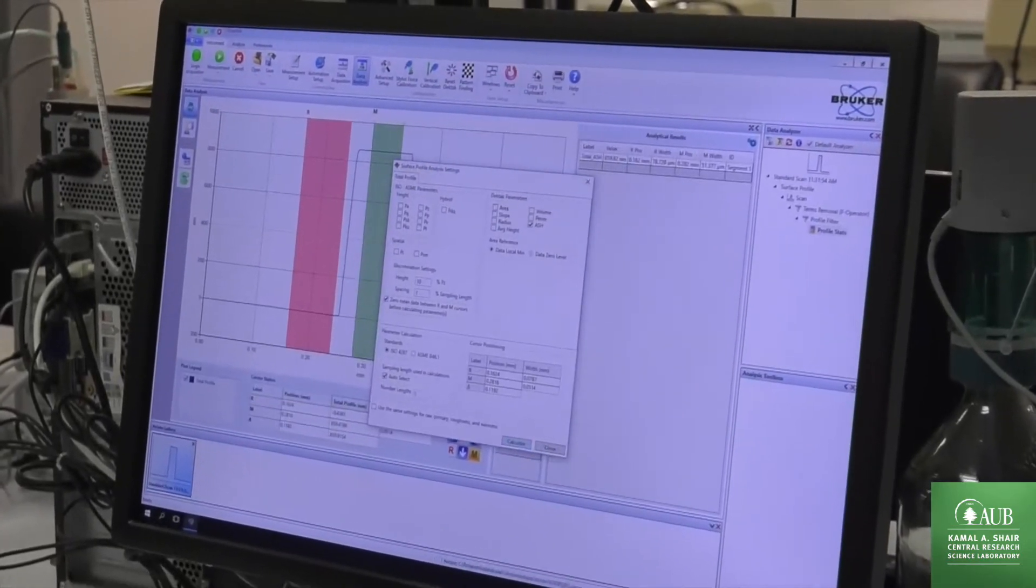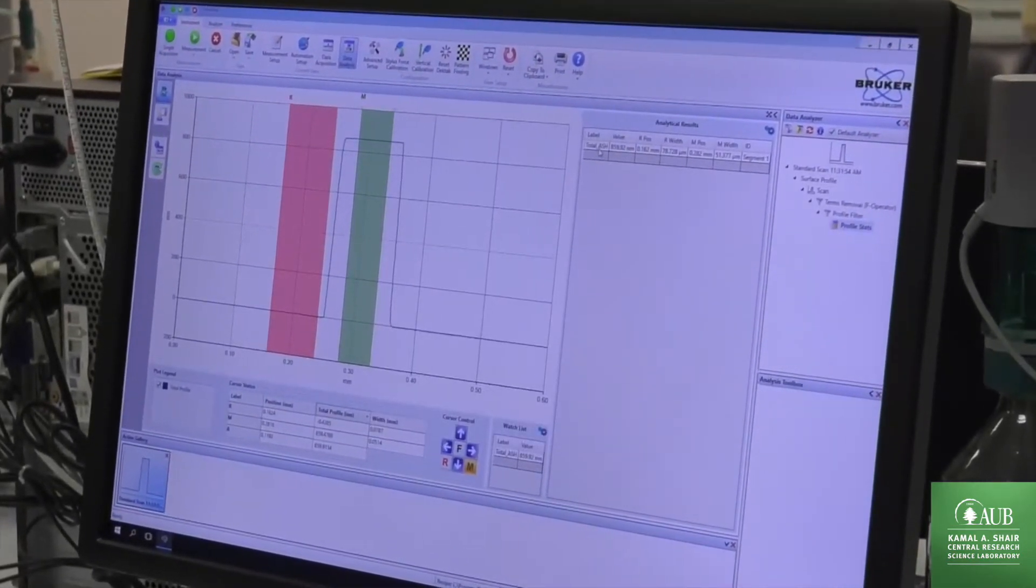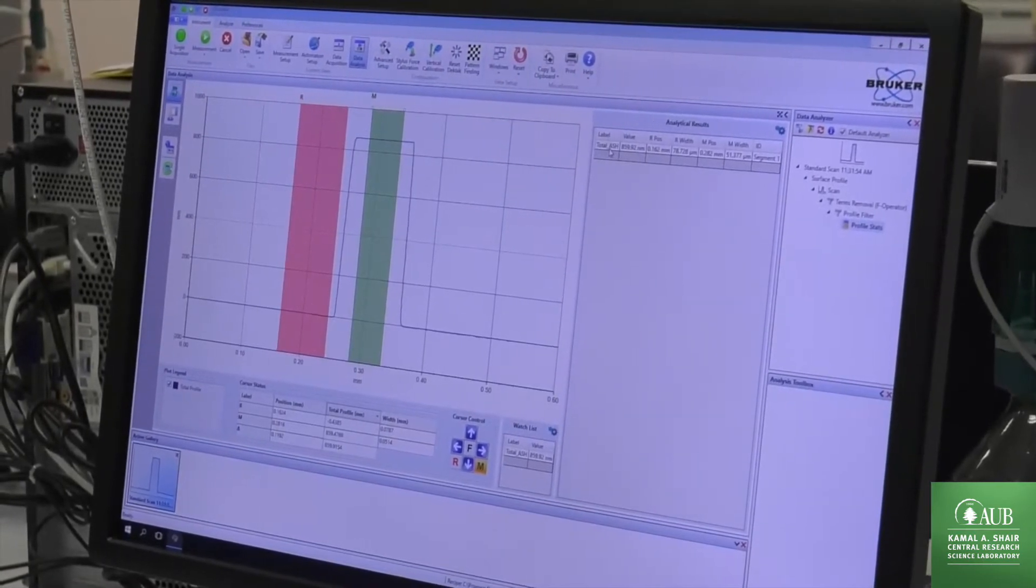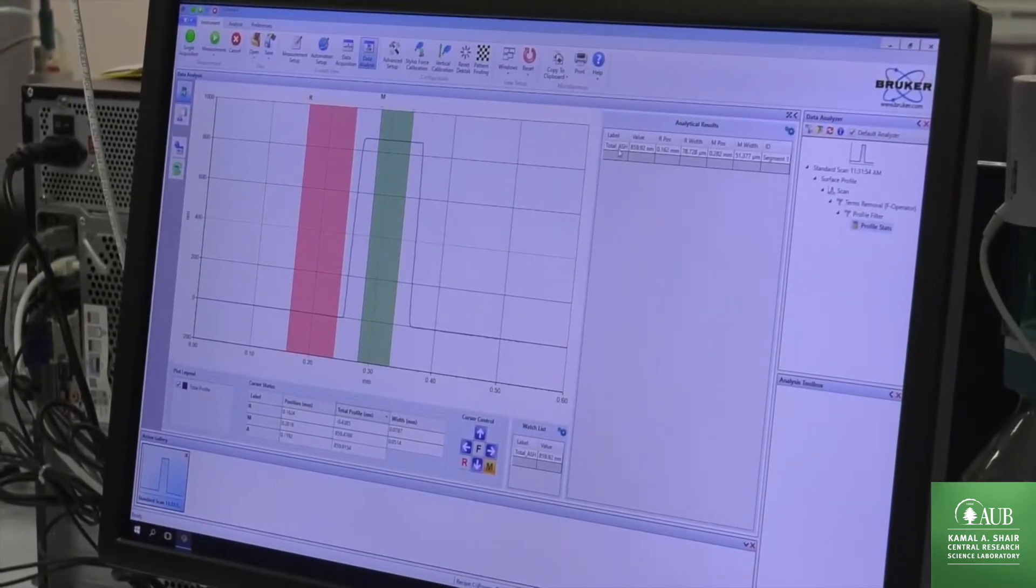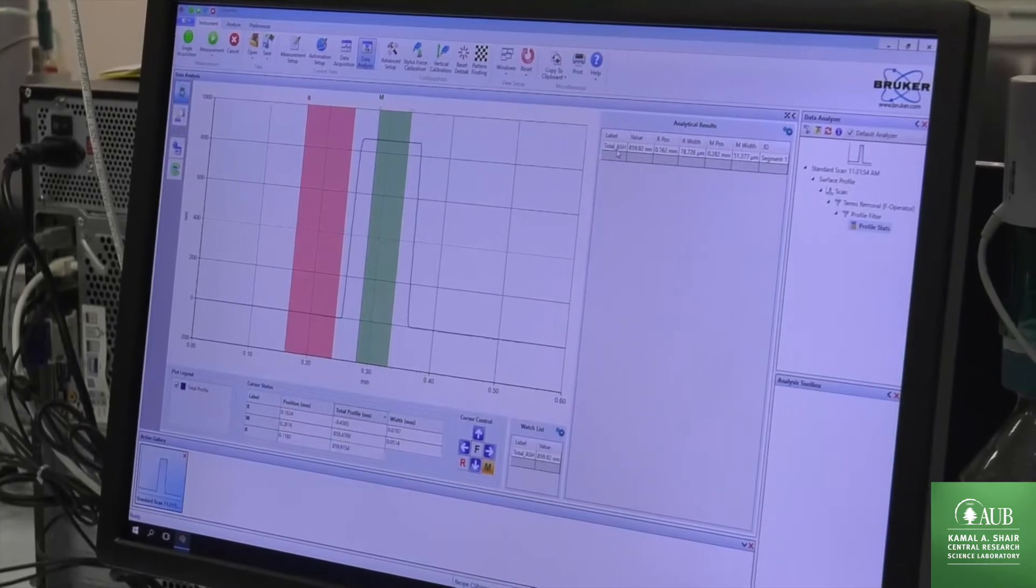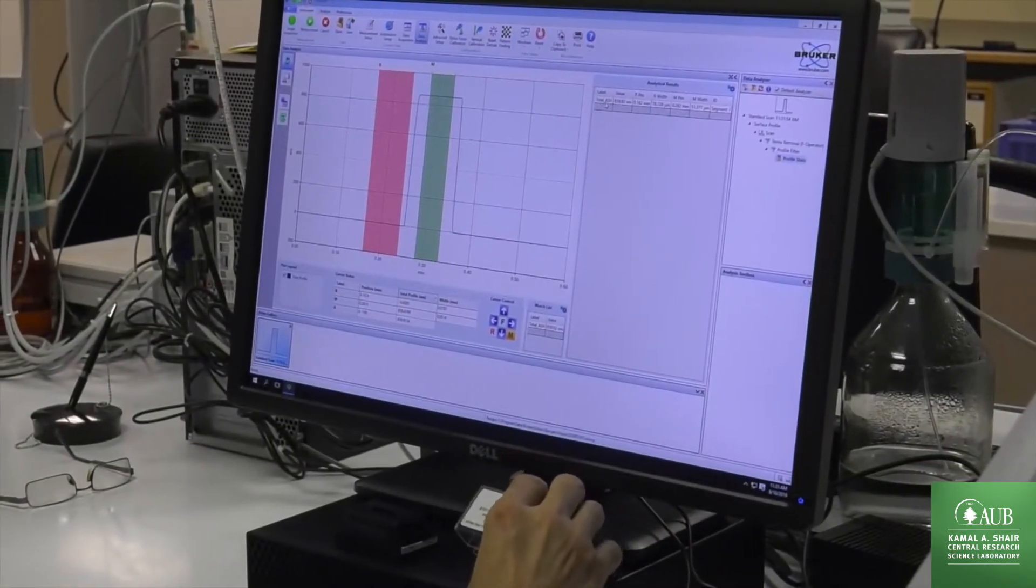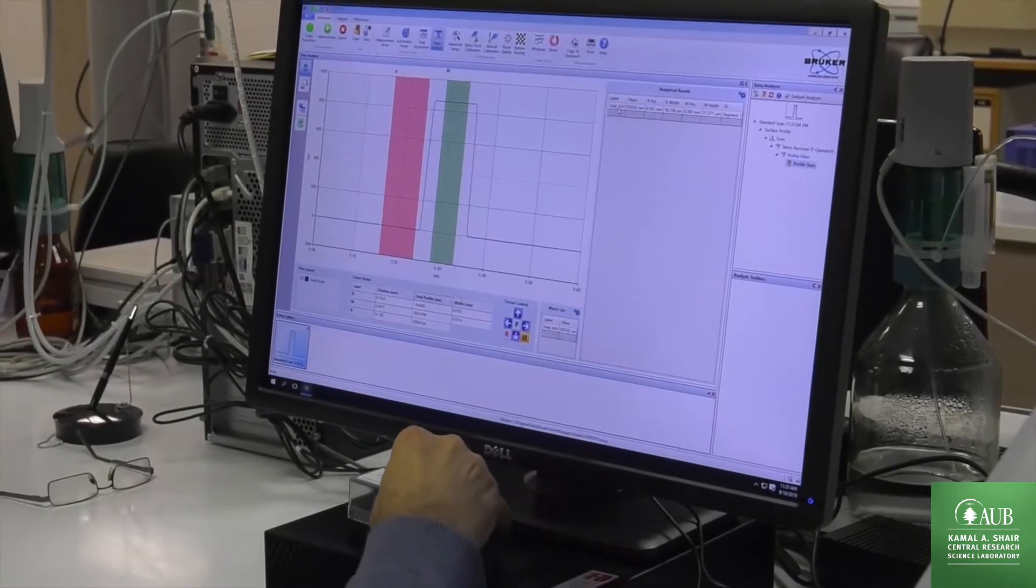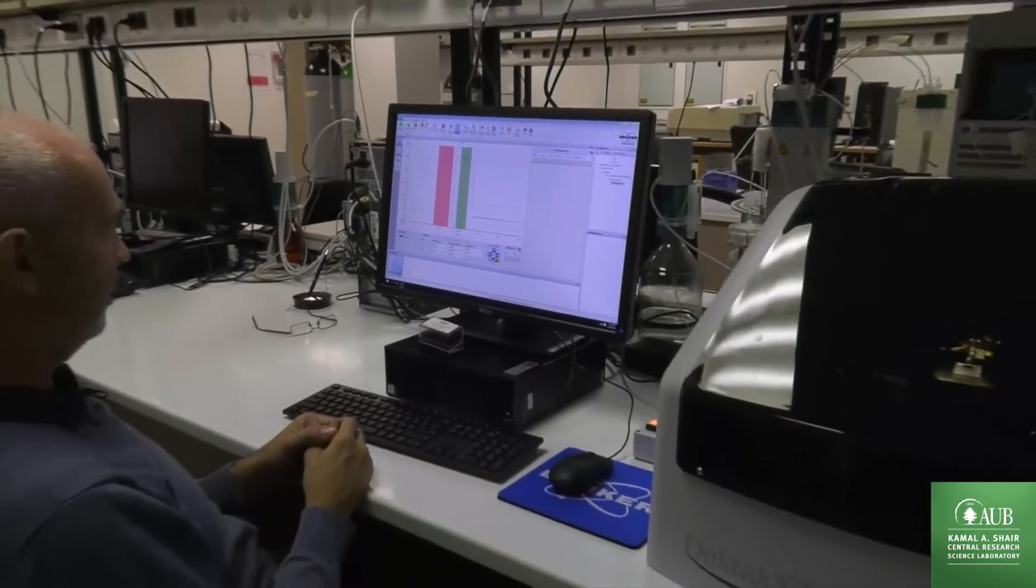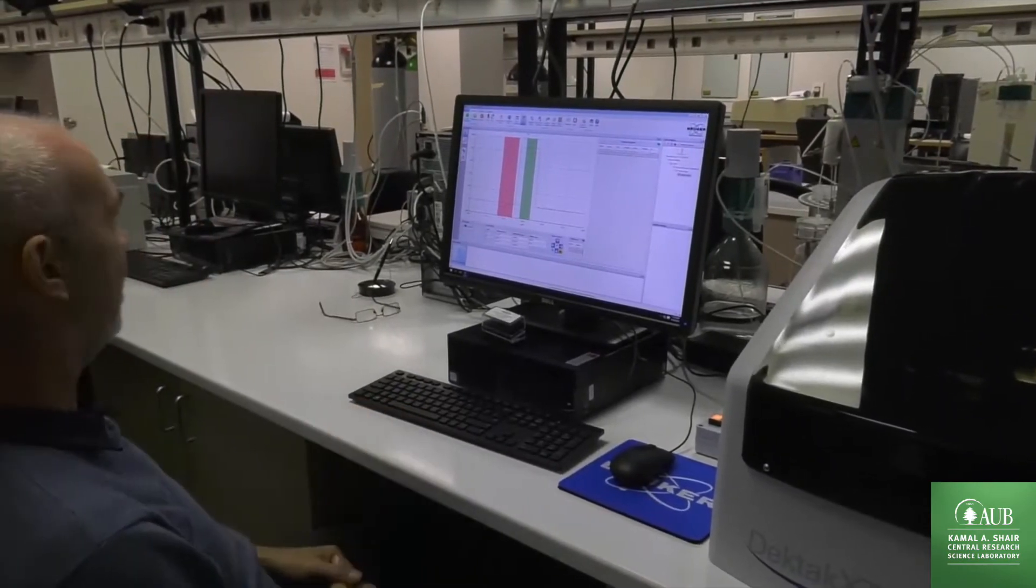Calculate and we get our result in here. Our average step height is 859.9 nanometer, where the specification says 860.3 nanometer. So we are very happy. That was measuring step height in a nutshell.